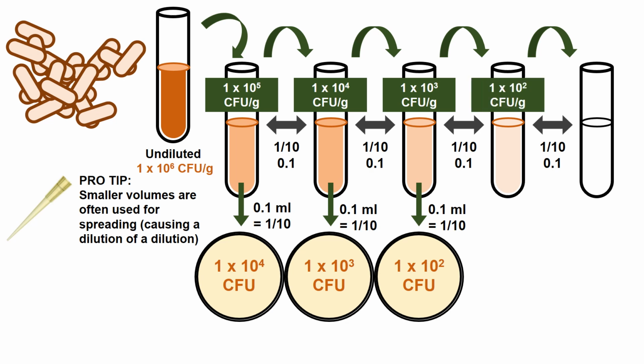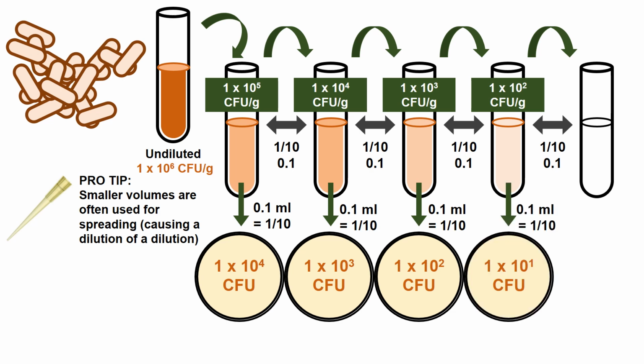Let's do that. Let's show you, okay? This is still the same concentration as it's been in our dilution series, but we're only taking 0.1 mils, and so that ends up with 10 colonies. That was the last number of colony forming units we had in our last example, where we were spreading 1 mil.